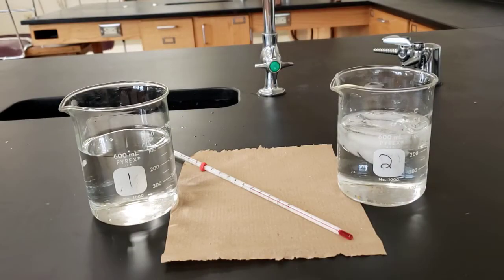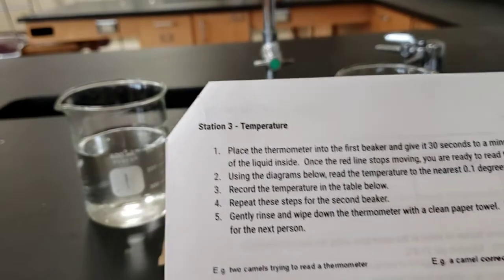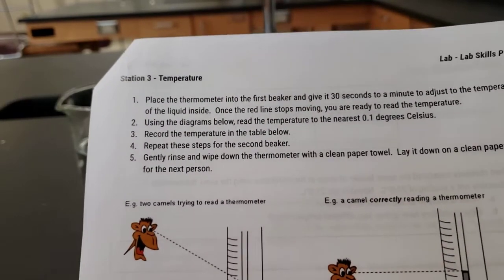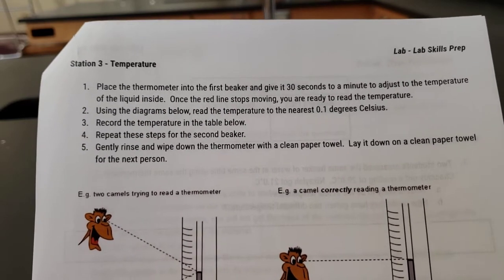This time we are going to be finishing up with the very last station on there. So this starts on page 3, finishes up on page 4, the temperature station. Again, we're going to be going through this lab as if you were in the class, and I will go over a measurement with you and you will do another measurement.